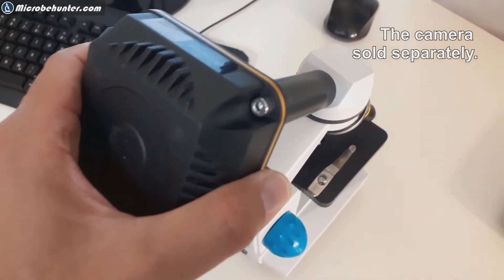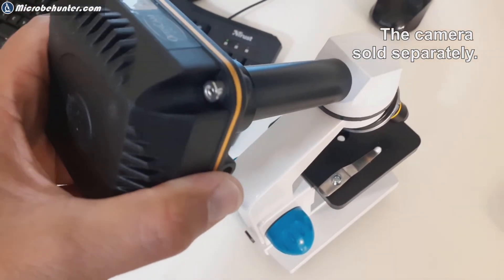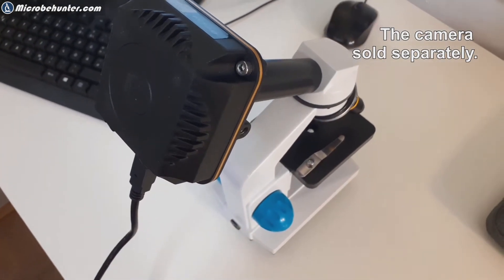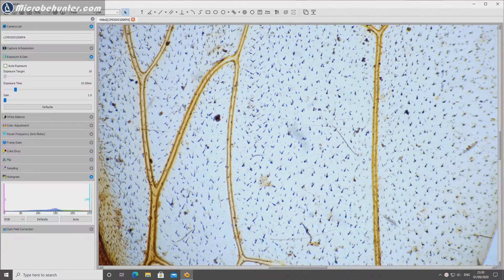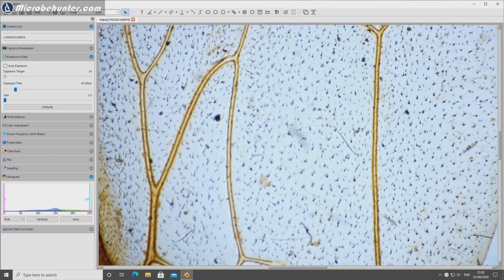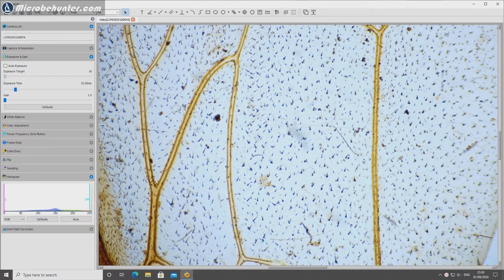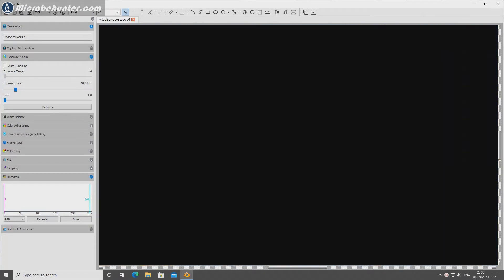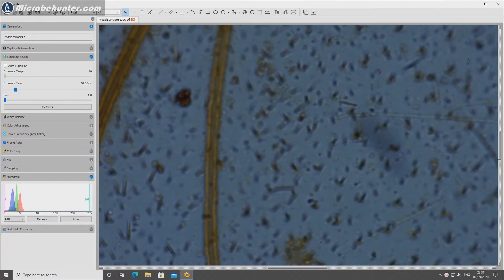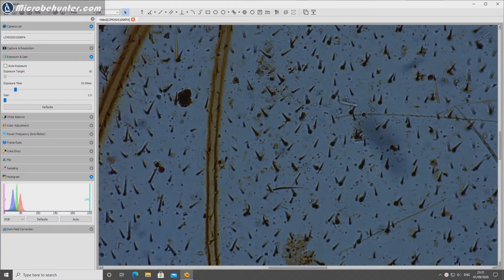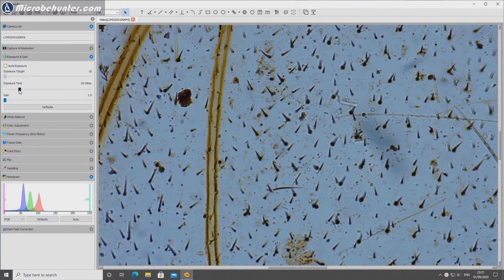Here I am connecting now a digital USB camera and I just want to put now some of the specimens under the microscope. Here this is a wing of a bee. I'm using software called ToupView and I'm able to use the software also to take pictures to make measurements and all of these things. I'm focusing back and forth.